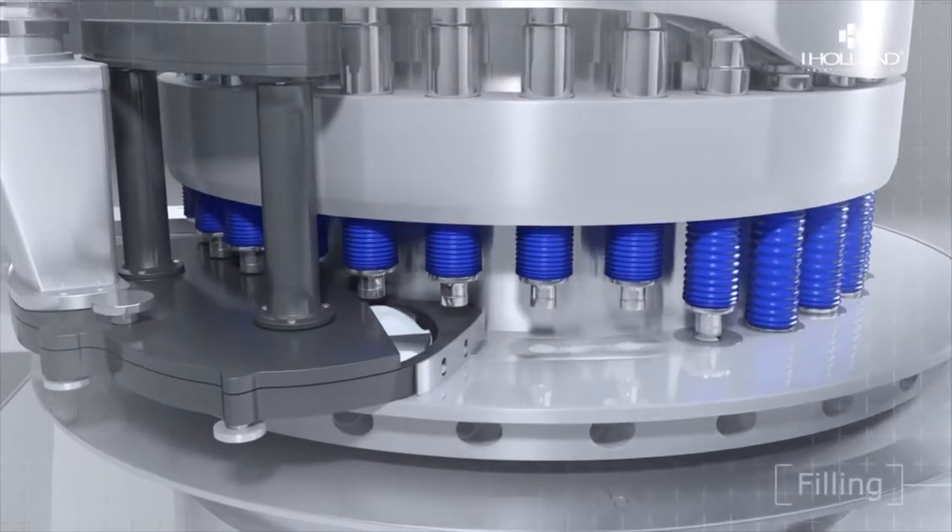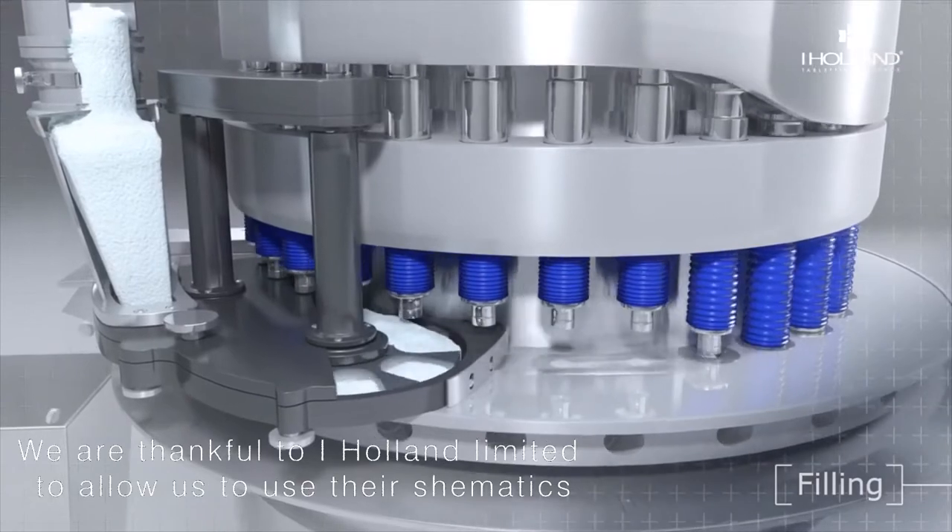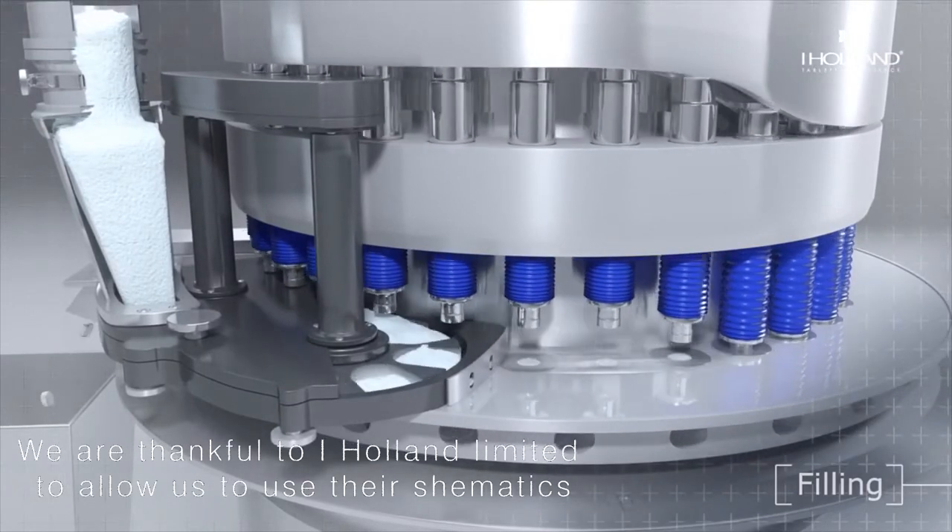Now let us see schematically how a powder is filled. The powder is fed into the hopper, which comes into the feed frame. The black portion of the schematic is the feed frame. From the feed frame, the powder is fed into the die.